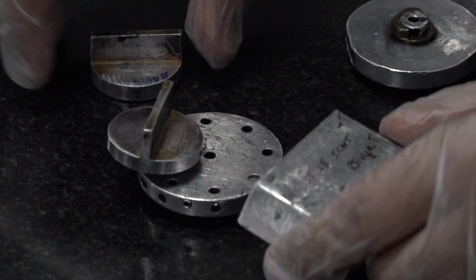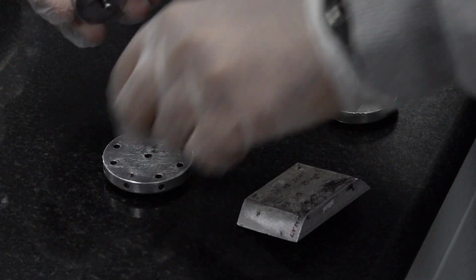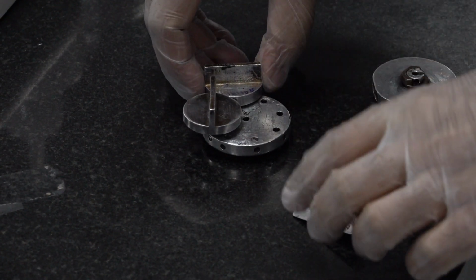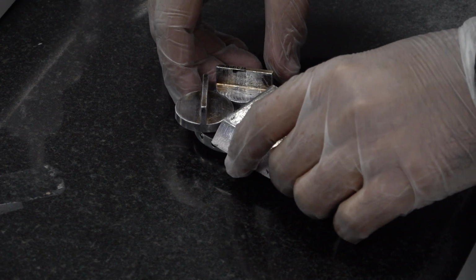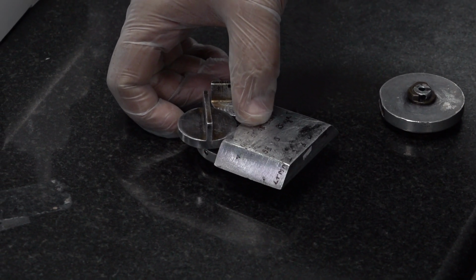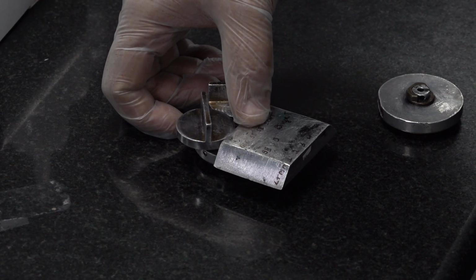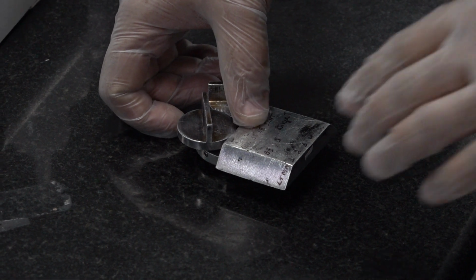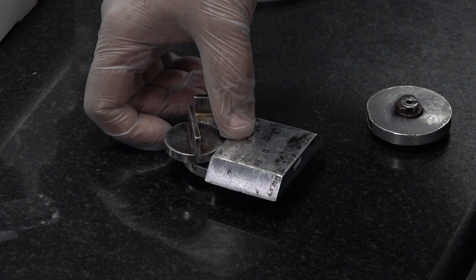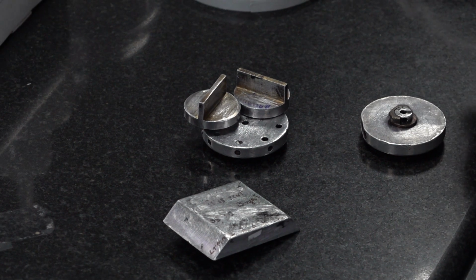As you can see here, I have a multi-stub holder as well. What I can do is paste one sample holder, a second sample holder, and then this one also we can add. What it does for our advantage is, as you know, SEM is a vacuum instrument. It uses vacuum to achieve the electron beam. So once you keep all the samples inside, you don't have to break the vacuum again and again in order to insert the sample.